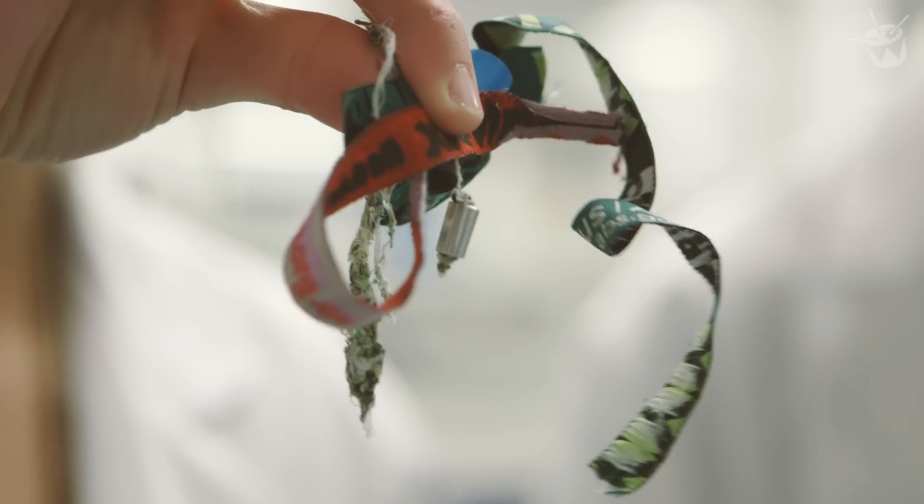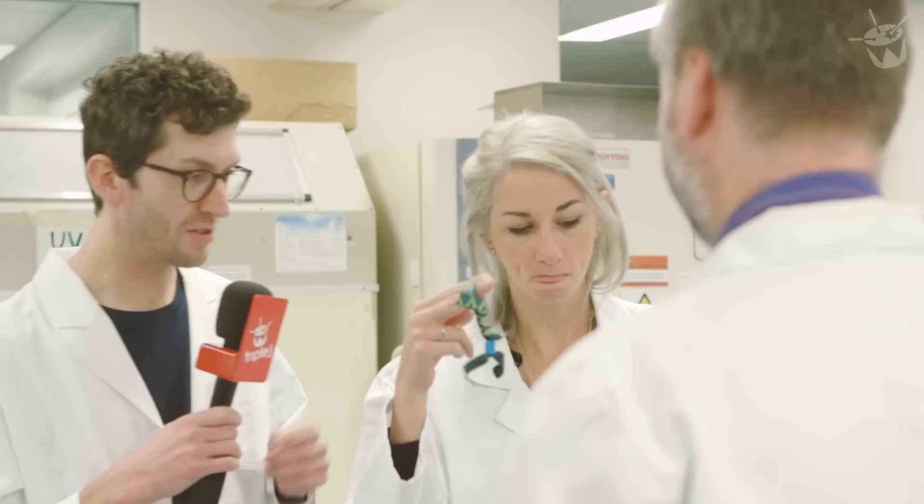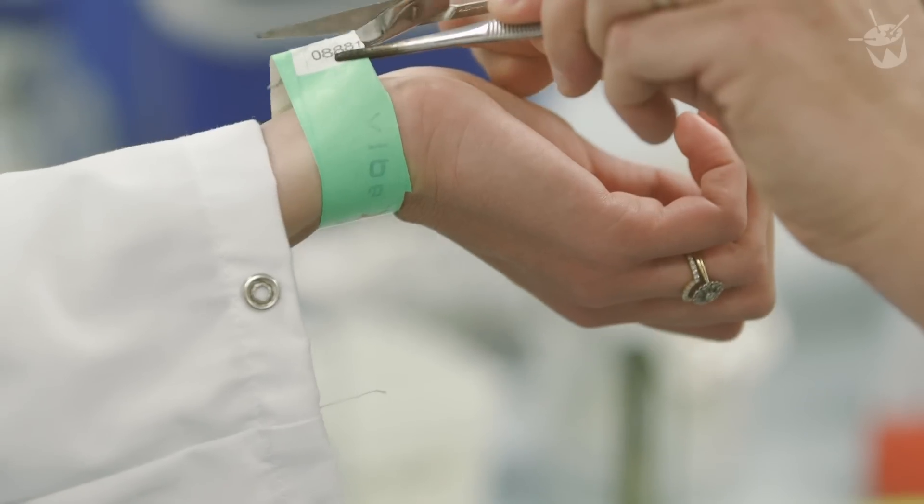Hi, Dr Nick. Hi everybody. Thank you very much. So we've got three festival wristbands here — how did that even stay on his wrist? We also have the one on Veronica's wrist, which she just put on about an hour ago, just as a fresh one.